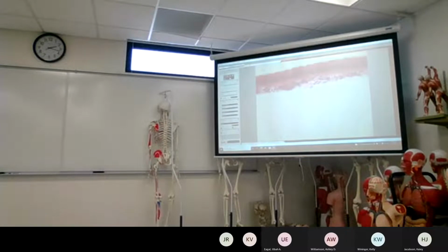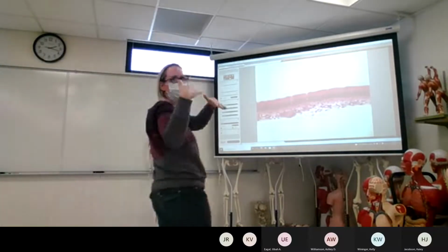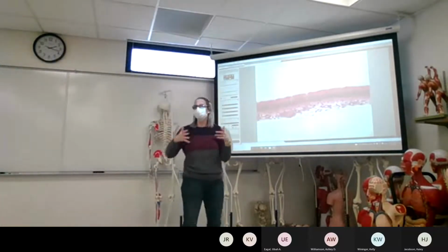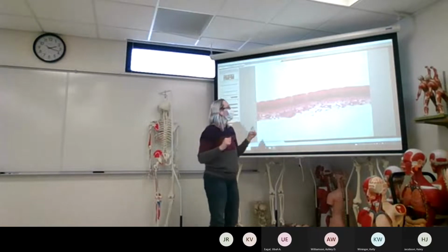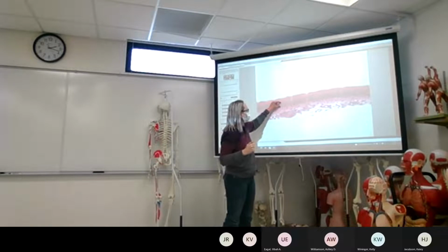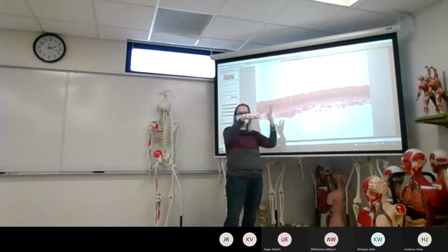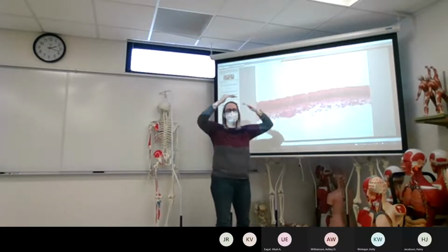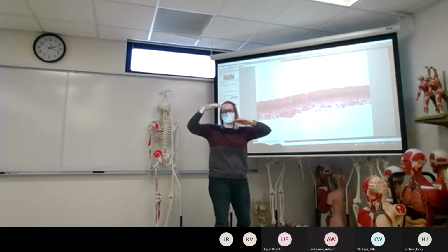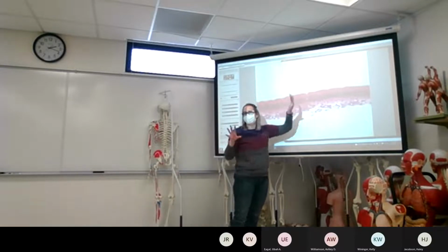Now, the difference here is if you were to be able to get clear images of a simple columnar segment, the nuclei tend to line up. Here, the nuclei can kind of range a little bit because I like to think of these cells as like they kind of weave around each other, and as they do, the nuclei can kind of get pushed up and around, and that gives the impression that they're multi-layered, but they're really single.